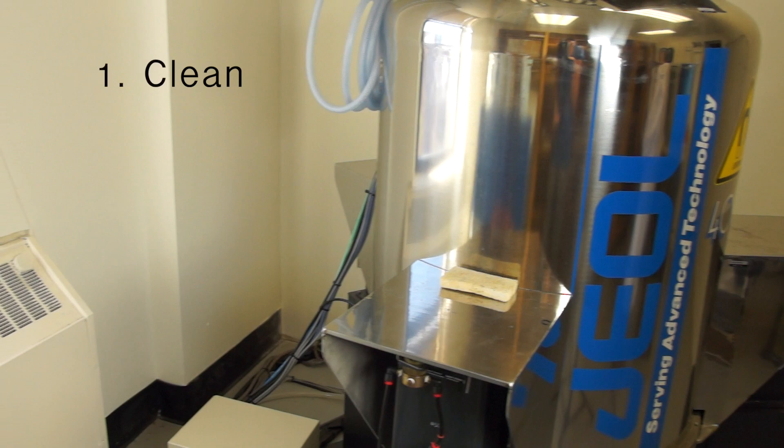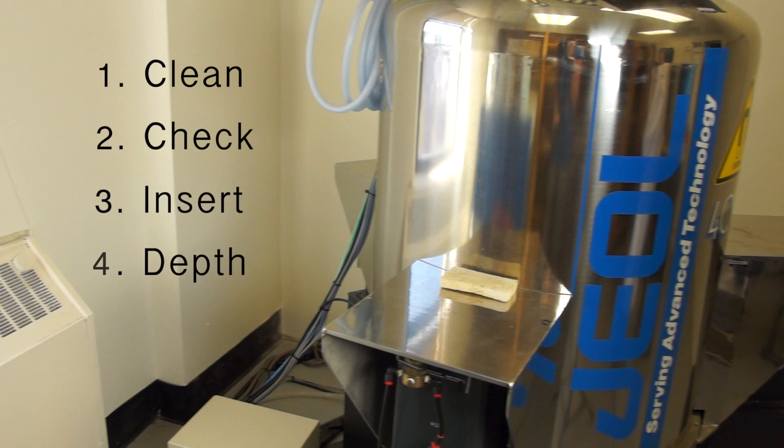To summarize, first clean the NMR tube. Then check to make sure the spinner turbine is fully extended. Insert the NMR tube into the spinner turbine. Check the depth of the NMR tube. And then finally, place the NMR tube and spinner turbine into the NMR carousel.